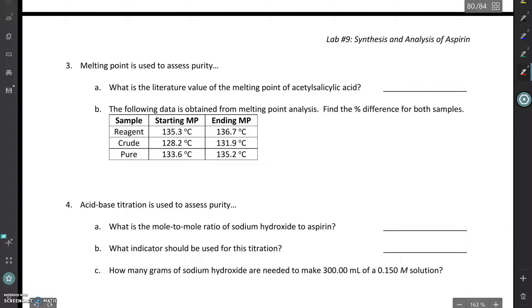Okay, so before we cut the video off, let's look at some calculations. Really no calculations to do with the iron test. We're simply just looking to see what color the iron chloride solution turns, if it does in fact turn color. So we're going to use our melting point analysis.